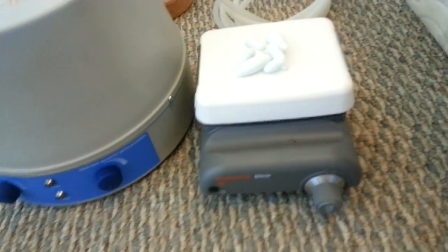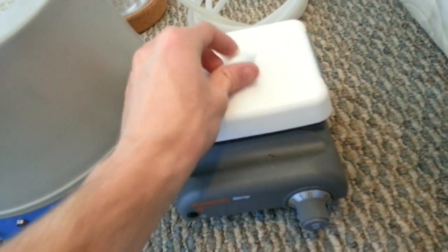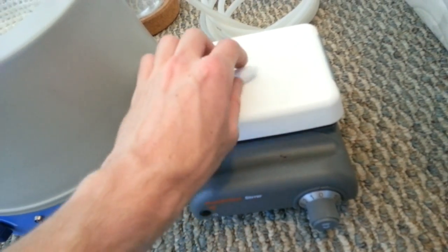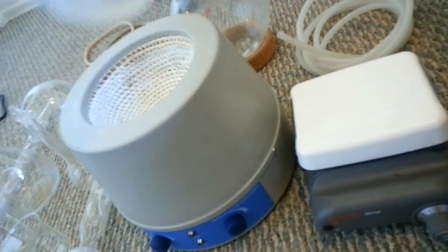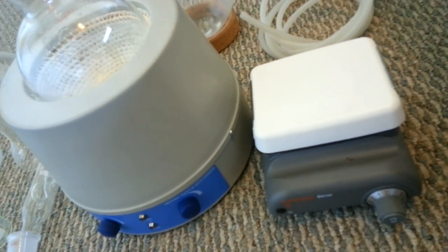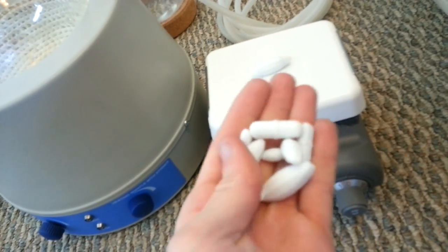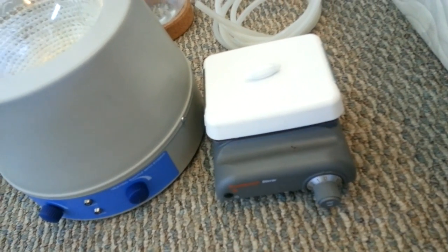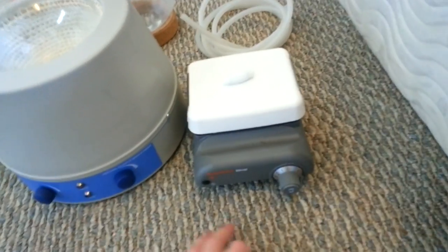Magnetic stirrer: you don't need this, but you probably should get it. It's got a magnet under the plate and what you do is you set one of the little stir bars on top — it spins around as the magnet spins and stirs whatever kind of stuff you have in the flask. You put the stir bar in the flask and then the flask on top of the stirrer, and it stirs it through the glass because it's a magnet. Also get some various sizes of magnetic stir bars.